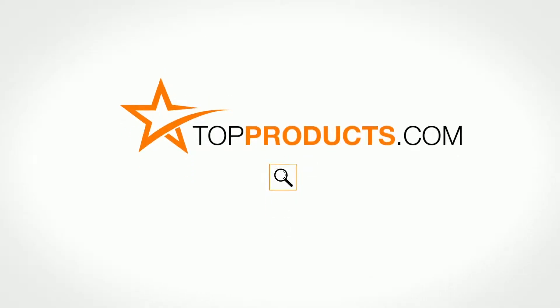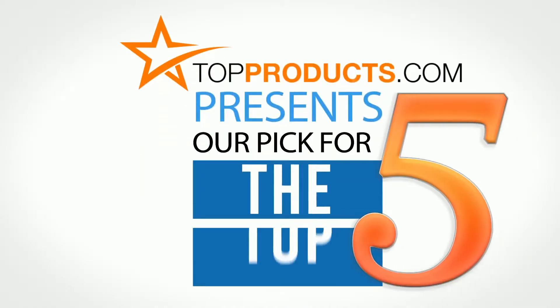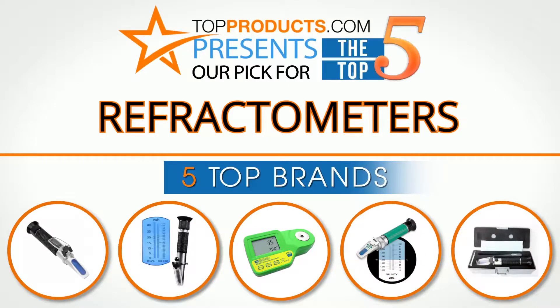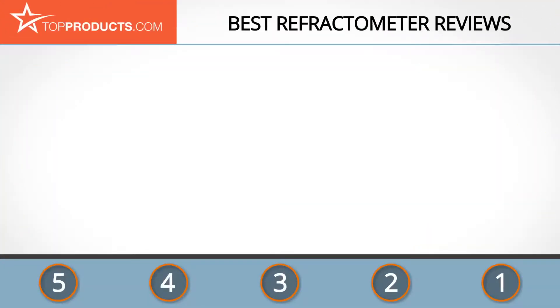TopProducts.com presents our pick for the top five refractometers. For this review, we chose five brands known for quality refractometers, showcasing a variety of options available.